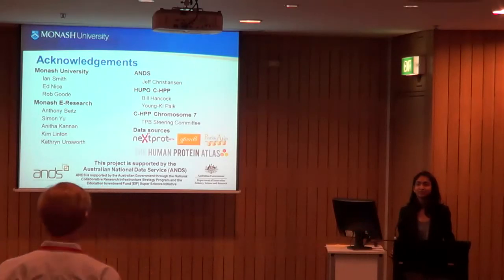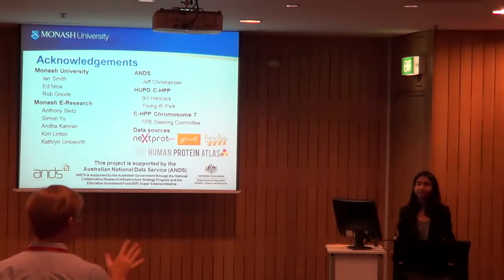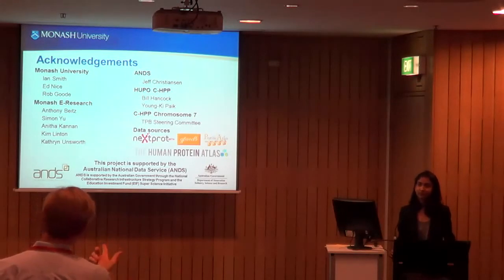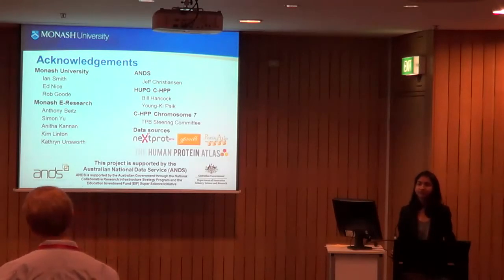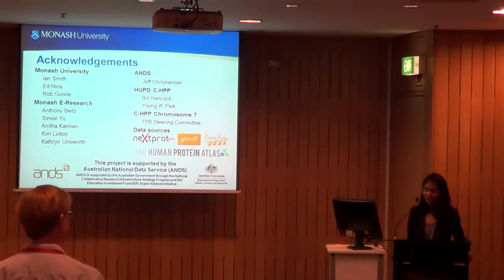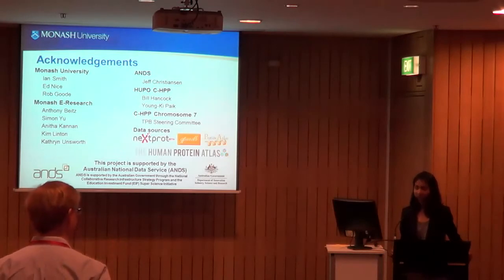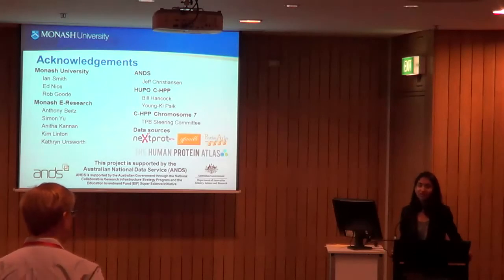Hi, Jason Swedler from University of Dundee. So it seems like the presentation of the data takes inspiration from the sort of gene tracks that Santa Cruz, UCSC, et cetera, have, and that's great because that's such a great standard and it works so well. But thinking about the data that you're going to be generating, our lab is generating analysis in HeLa cells and someone else in U2OS, and already there are differences in P53 right there, right? So how do we scale this? I'm less concerned about the data because I'm sure you can, but the presentation really of the complexity of that and post-translational modifications, et cetera. So where does that all go?